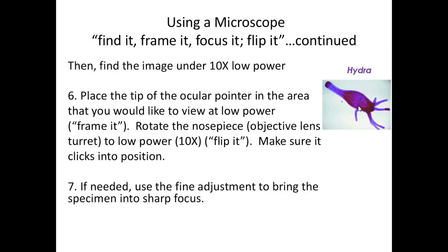So when you rotate your objective lens, this should always be at that center point. You don't lose it when you get closer in, all right? And once you rotate to your 10X or higher, you can use your fine focus. Always after the 4X, you only ever want to use your fine focus, because what happens is you're very, very close to this glass slide with this microscope, with these objective lenses.